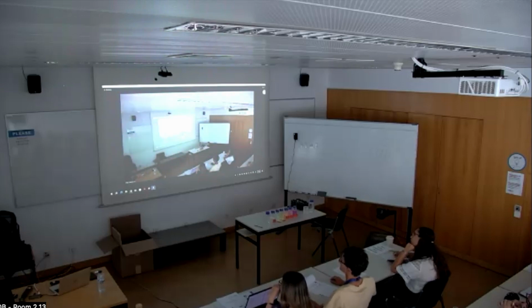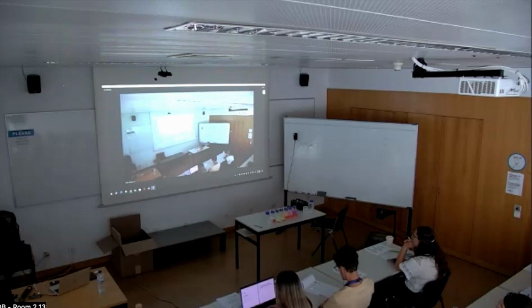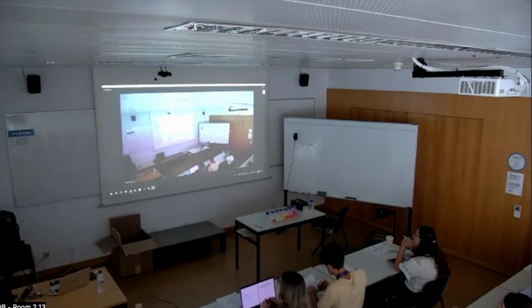You got it right. It's true, and so it's extremely important that you absorb this experience. Smaller features will generate a larger diffraction pattern, and bigger features will generate a smaller diffraction pattern. This will acquire enormous importance when you understand how images are generated, and why there is a certain limit to resolution, because everything depends basically on diffraction, eventually, not completely everything. Okay, but so Peter Rennert was not so wrong after all.